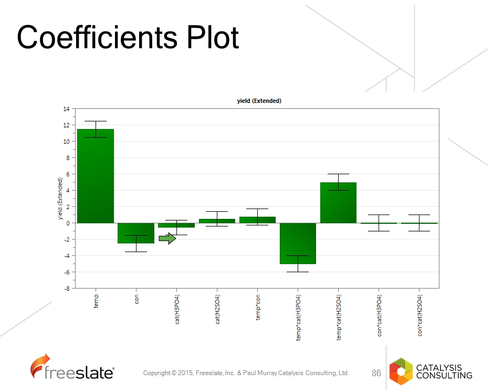We have 2 acids here. So we have the 2 acids, one's having a negative and the other's having a positive effect. But the error bar goes through the origin. So what this is saying is that the acid on its own is not significant. So why is it still in there? We'll see in a moment.